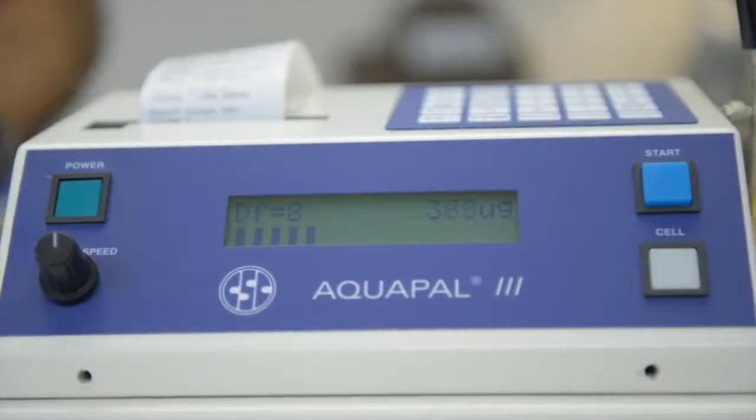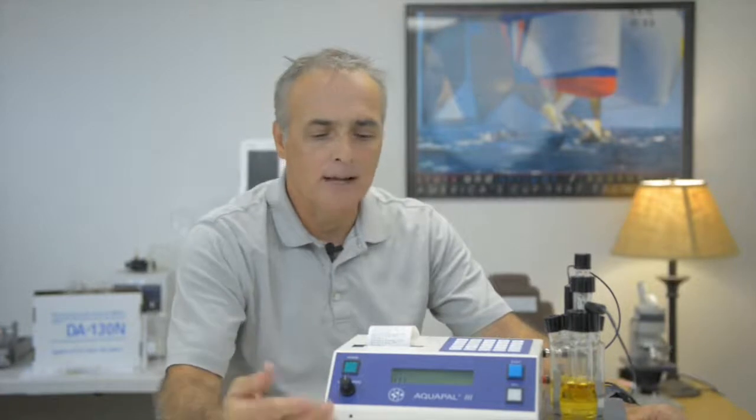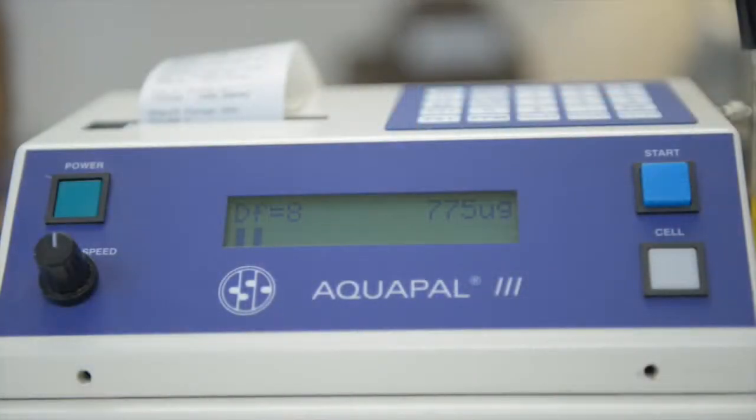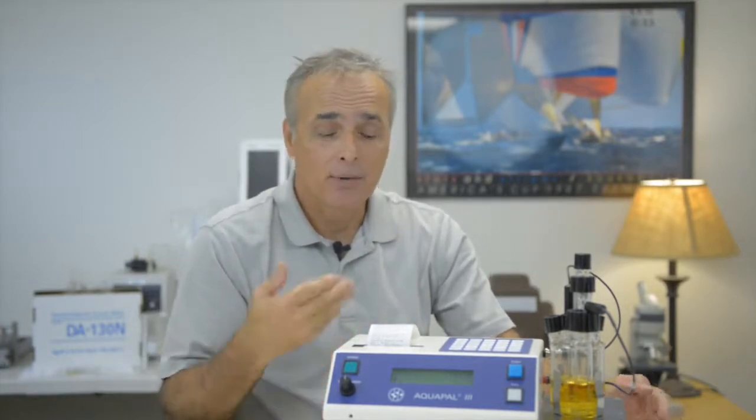And then it's going to measure. Okay, so the test has been running, and it's winding down to the end point. When it's finished, it automatically prints out the results. So no need to enter a weight. It knows the volume, it knows the specific gravity, and it prints out your result.